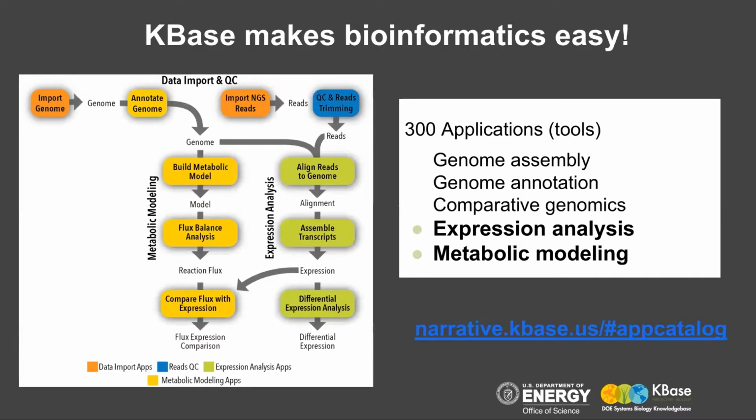So let us talk about KBase now. KBase is open source and it is available for anyone to use. It is free. In KBase, our goal is to develop an intuitive and robust workflow so that researchers without any programming knowledge can quickly run the tools in the narrative interface. In addition, in KBase, you can also integrate these tools seamlessly with other workflows to generate novel hypotheses.